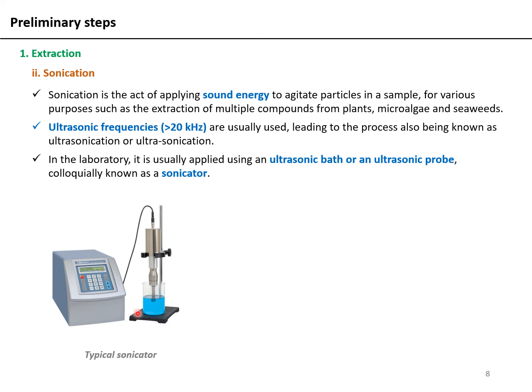You have this machine using which you can set the frequency at which you want the ultrasonic waves to be released. You can set the on and off time, that is how long you want the wave to be released and then how long you want it to be off. Typically, because sonication generates a lot of heat, your sample which is being sonicated has to be kept on ice. It is an absolute must. Otherwise, the heat released from sonication can denature your proteins of interest.